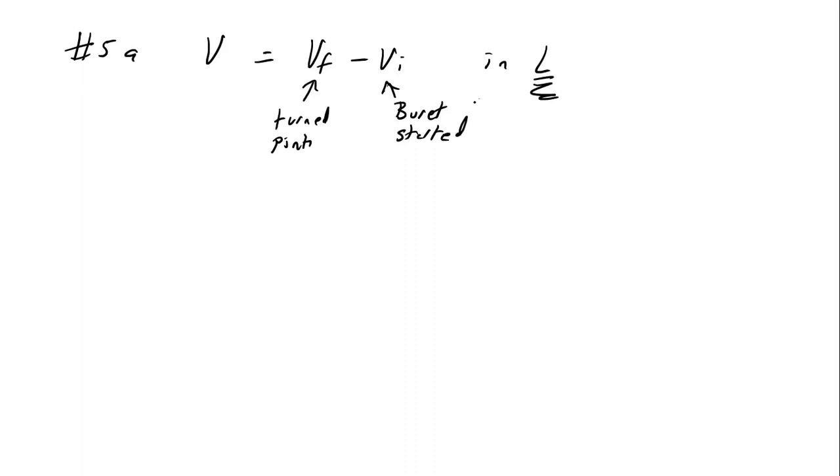Okay? So what you can do is that if you're less than 25 milliliters on the first titration, you don't need to refill it unless you're going between KHP and vinegar. At that point, you want to refill it. The vinegar may take more than 50 milliliters. So for the first experiment it may be 0, but the second one might be different. Yes. Your initial volume may be different.